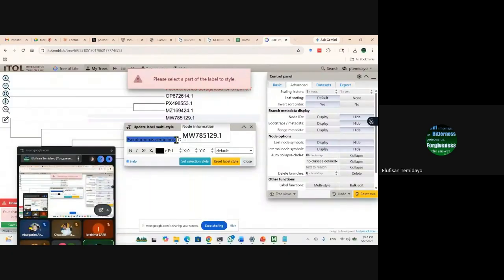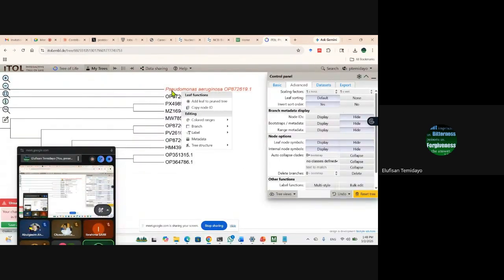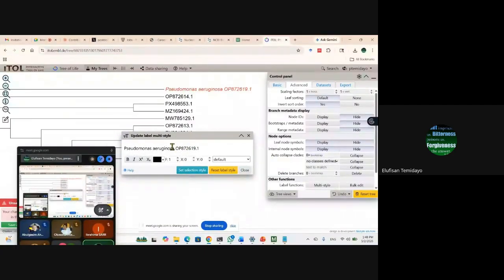Okay. Let's go back there. Select, italicize, close. Just give me a moment, please. The multi-label. Okay. I want to know what is wrong. Okay, I think it's fine now. And let me go to this guy. Oh, I don't want this. I'm trying to see what is happening.